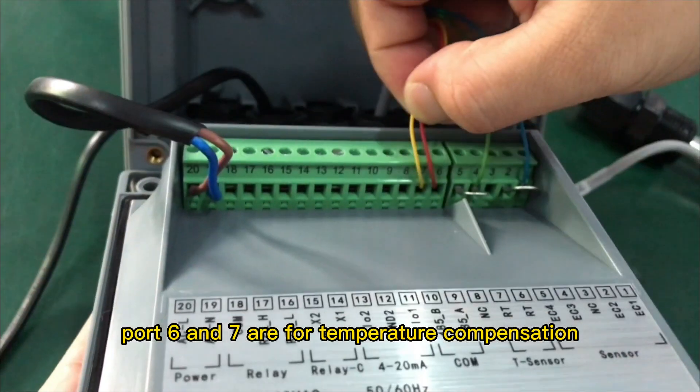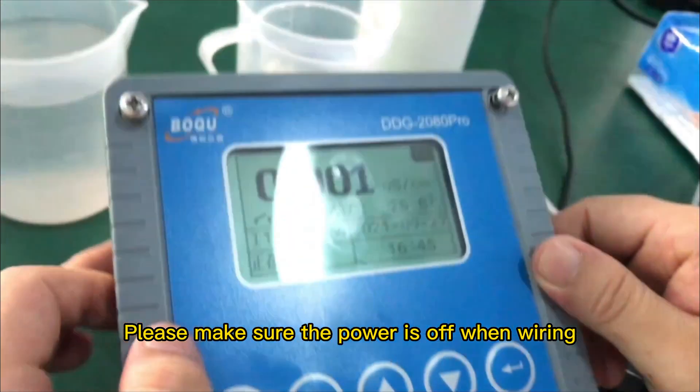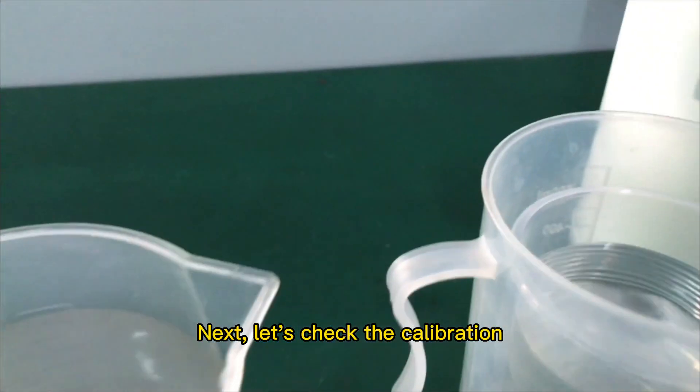Port 6 and 7 are for temperature compensation. Please make sure the power is off when wiring. Next, let's check the calibration.